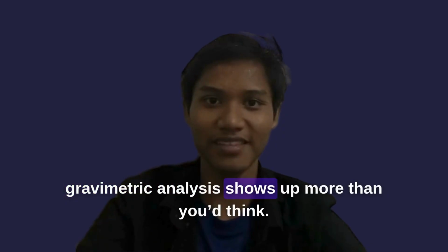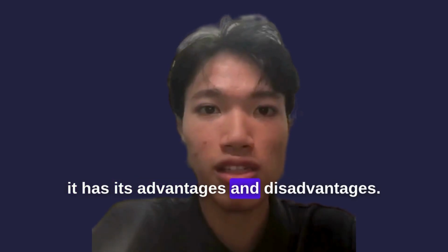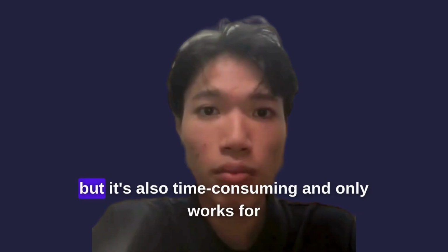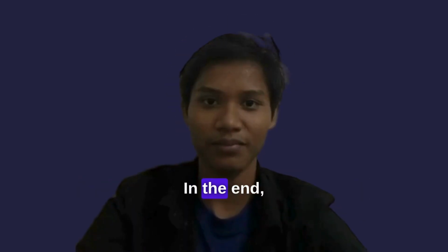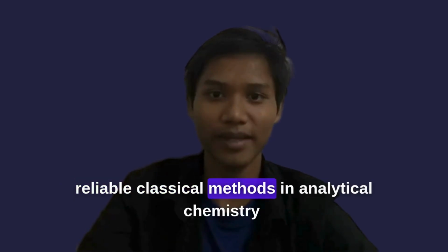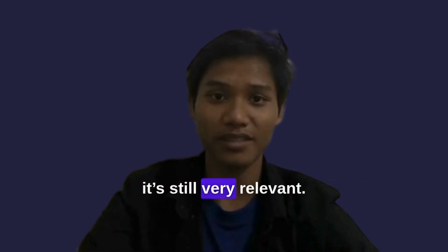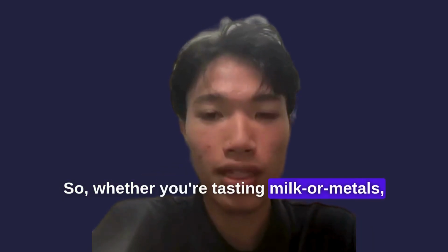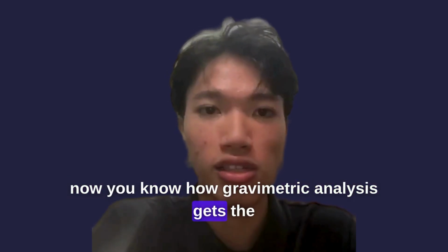Basically, gravimetric analysis shows up more than you think. And of course, like everything else, it has its advantages and disadvantages. It's accurate, cheap, and doesn't need high-tech machines, but it's also time-consuming and only works for one thing at a time. In the end, gravimetric analysis is still one of the most reliable classical methods in analytical chemistry. And even though it's old school, it's still very relevant. So, whether you are testing milk or metals, or just trying to pass your lab class, now you know how gravimetric analysis gets the job done.